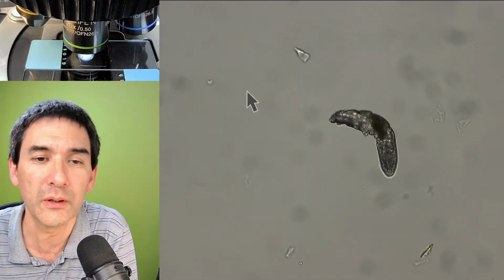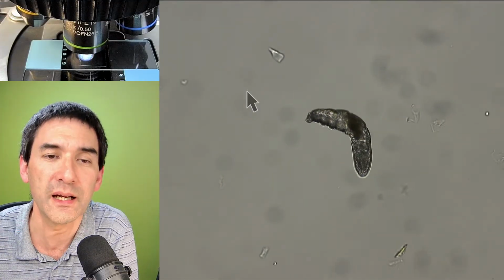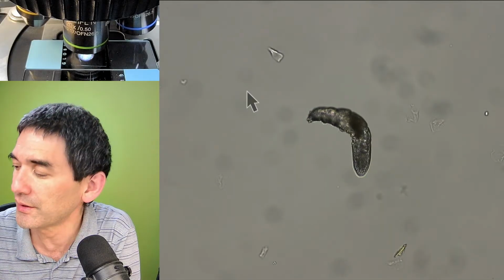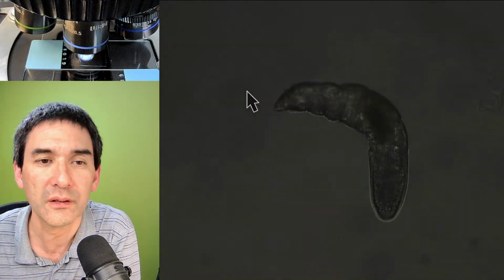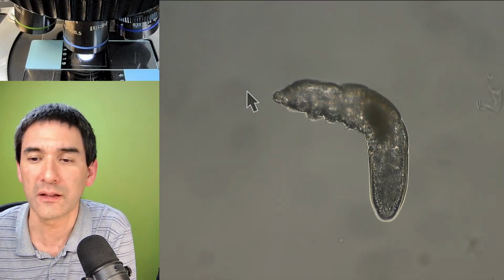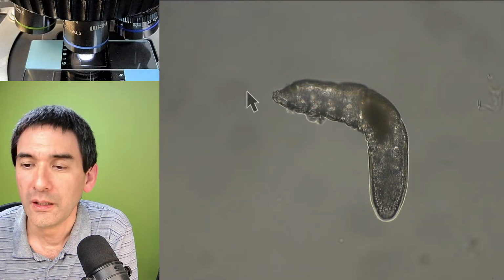I wonder how long I can keep it alive. I think I'm just going to keep the slide. The advantage of oil is it does not evaporate, and for this reason it should stay active. Okay. Yep.